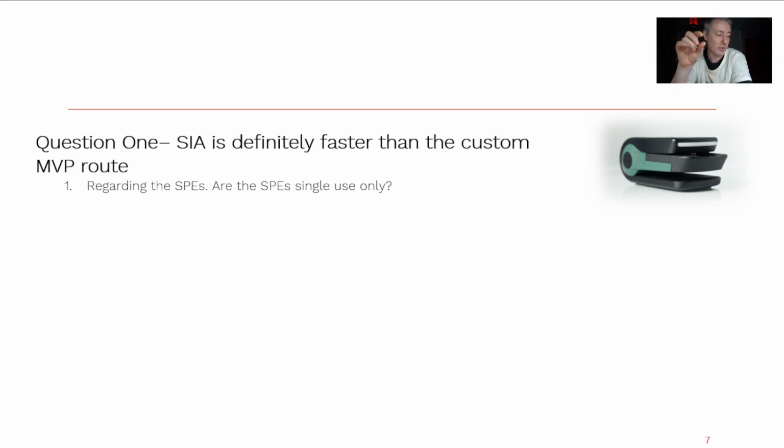You've got to have a business model where they take the sensor, use it, and dispose of it. You've got much more control in that situation. So the easy answer is that screen printed electrodes are single use. Actually, you can reuse them, but I'm not going to reuse any of mine tonight, especially when I'm doing assays, because I cannot predict what customers are going to do, and before you know it, they're complaining, saying, "Oh, it's not reproducible." It's like you didn't realize what people do with your material once it leaves the facility.